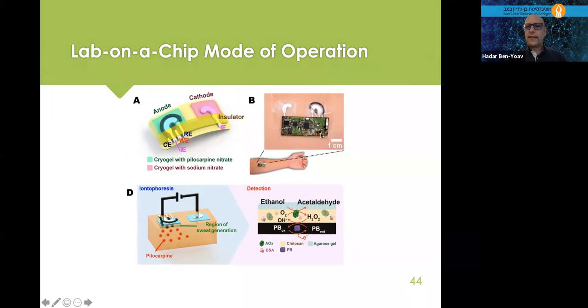Now this big thing is the electronics. It's actually very nice. You can use Arduino or Raspberry Pi. There are actually very nice online workshops right now. Maybe I can send you a link to the workshop later if anyone wants to develop some kind of Arduino circuits. They are very nice. You can order any types of off-the-shelf components and make your own board. And here, the board was reading the current and sending that wirelessly to the computer.